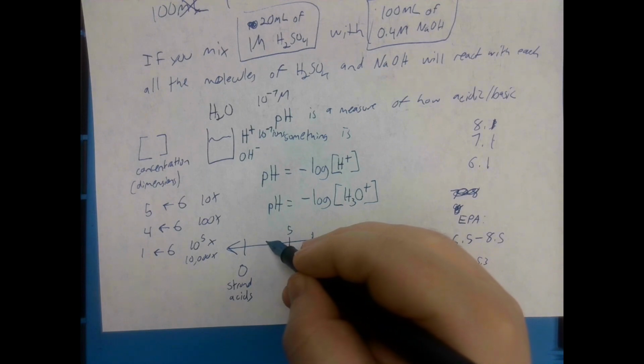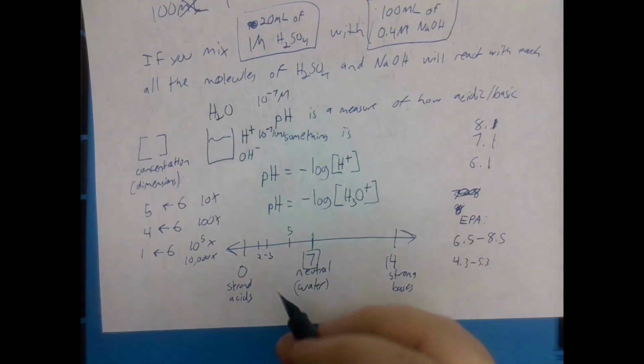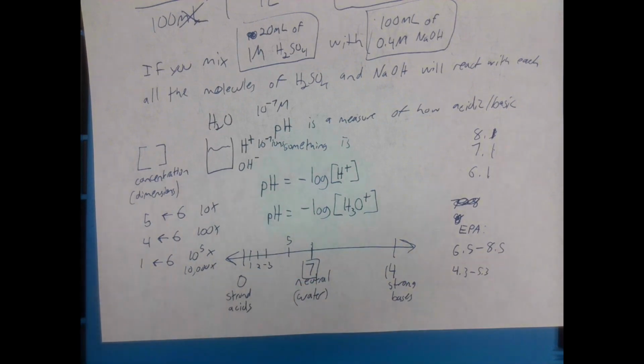Strong acid starts around 2 to 3. This is when you start having a really bad acid that you need to worry about. And if you get to 1 to 0, that's where you pull out your gloves and glasses before you handle it, as you could seriously hurt yourself. For example, the vinegar we were using, 5% vinegar, I'll actually look up its pH.